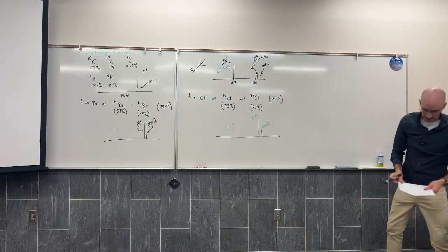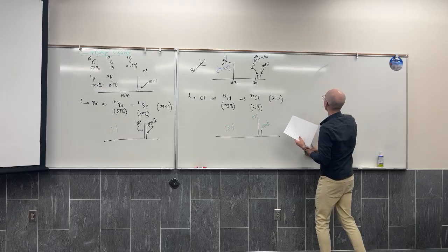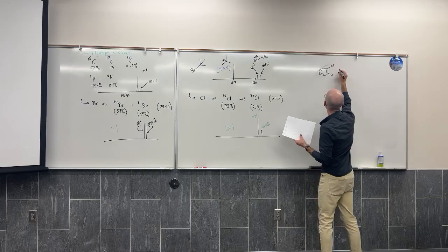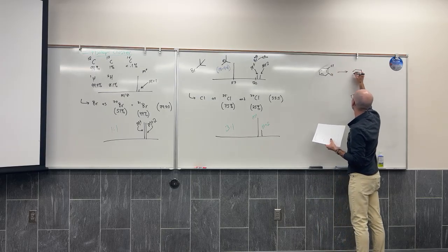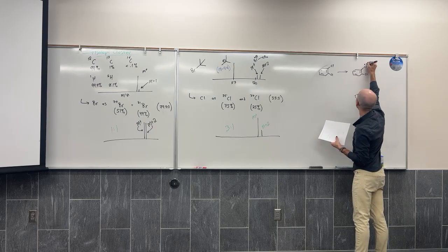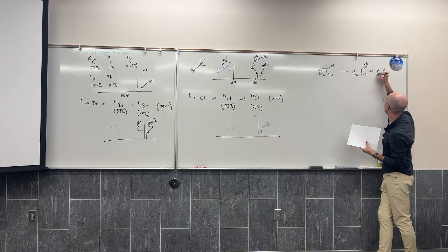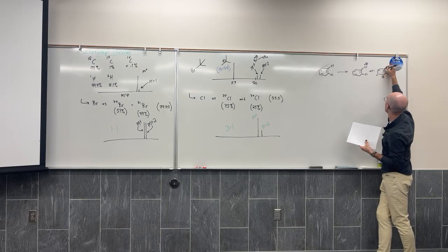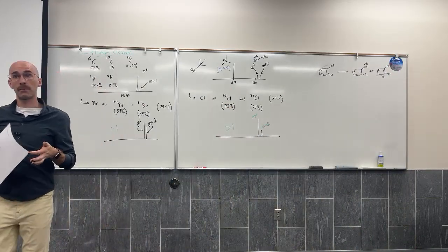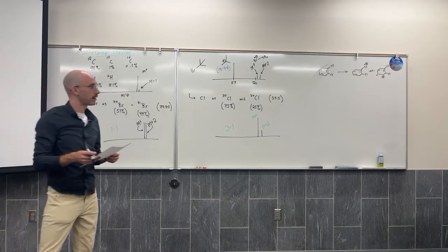The problem with this spectrum is that there are 2 chlorines, which changes the probability of what the isotopic cluster looks like. But if we were to form a molecular ion, there's a lot of different ways we could do it. It could be one of the chlorines loses a lone pair electron. It could be that one of the pi bonds loses an electron. There's a lot of ways for it to happen, and so it tends to happen a lot, and it becomes our molecular ion.